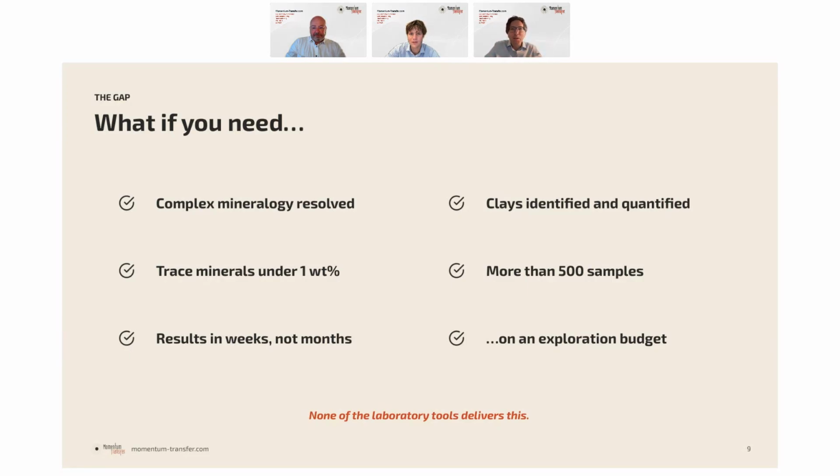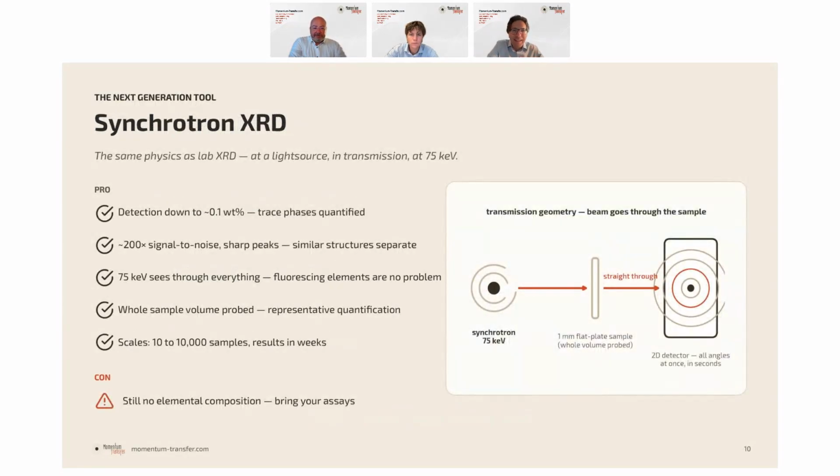And if you're on an exploration budget and don't have the cash to buy and sustain a laboratory for X-ray diffraction on your own, then of course laboratory devices will not deliver what you need. But luckily, there is something that can deliver all of those promises, and that is synchrotron X-ray diffraction.